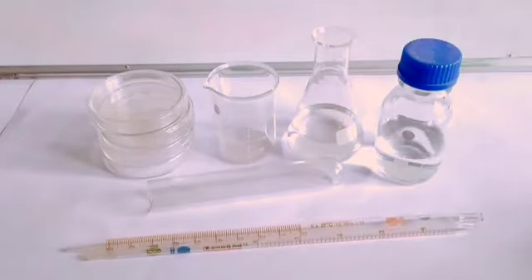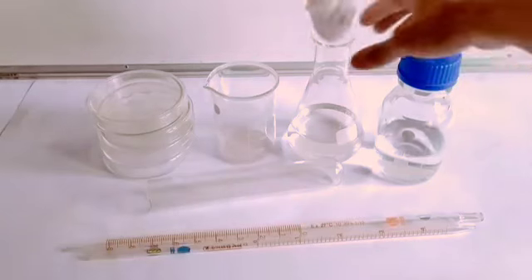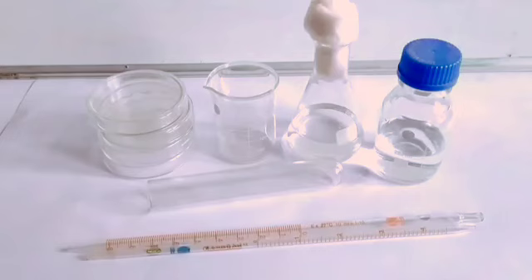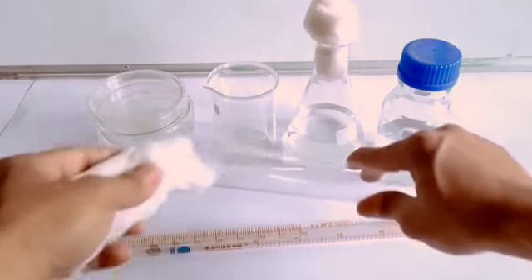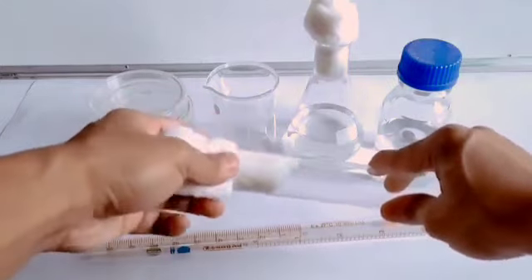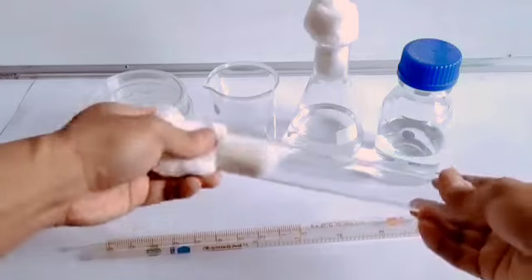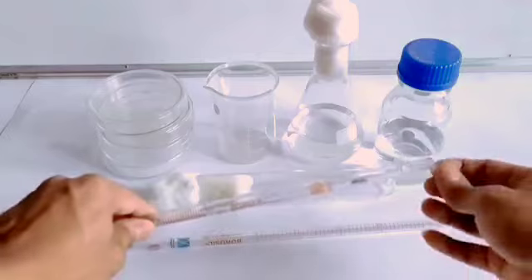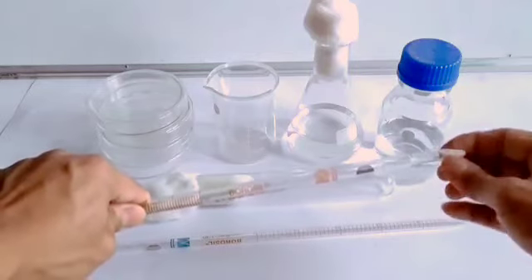For containers without screw caps and containing liquid media such as this Erlenmeyer flask, the mouth of the container is plugged with cotton as seen here. Remember that the liquid media inside a container should never be more than 2/3 full, as it runs the chance of spillage and boiling over. Culture test tubes which may or may not contain liquid media are also plugged with cotton in the mouth. In the case of pipettes, their mouths are plugged with a small roll of cotton like you see here.